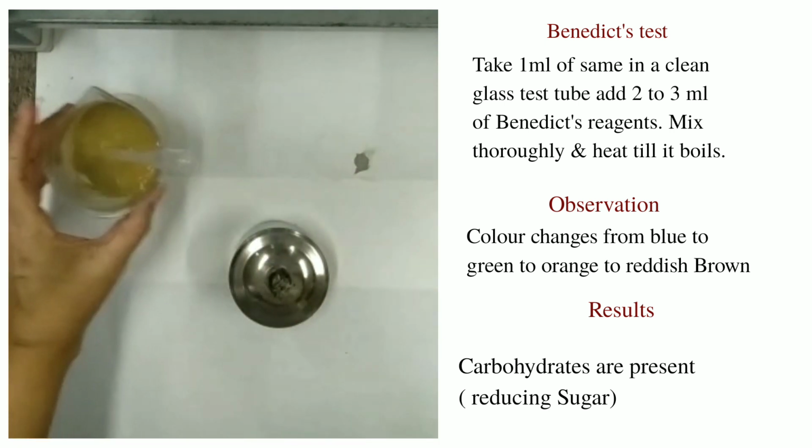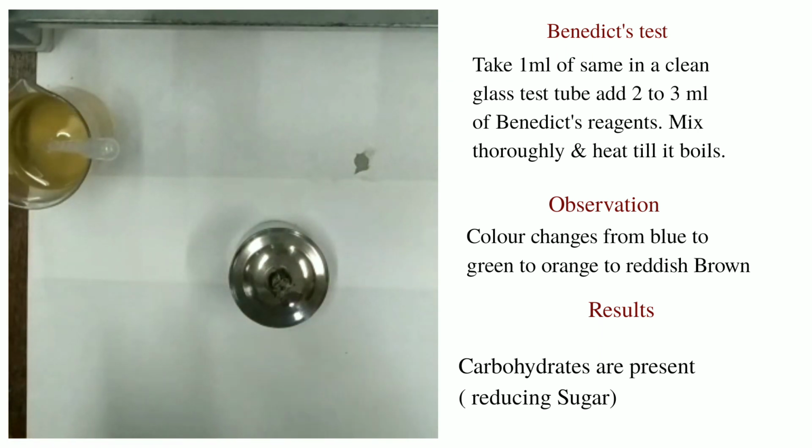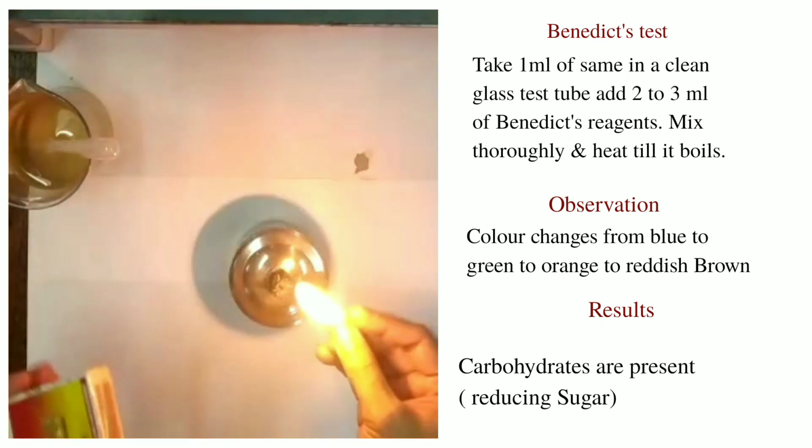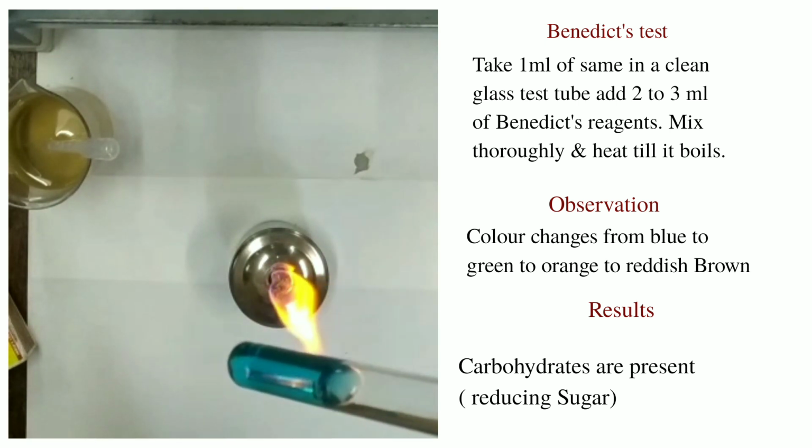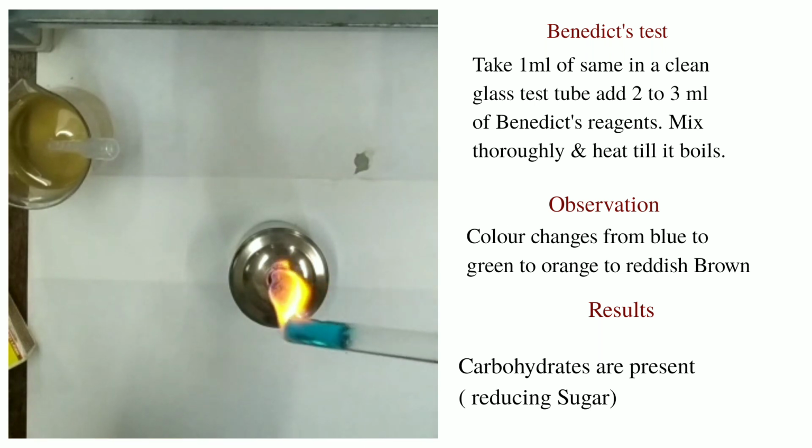Again take the spirit lamp. Light it. Hold the test tube with the test tube holder. So now you can see the solution is light blue in color. So let's see what will happen when we heat it.